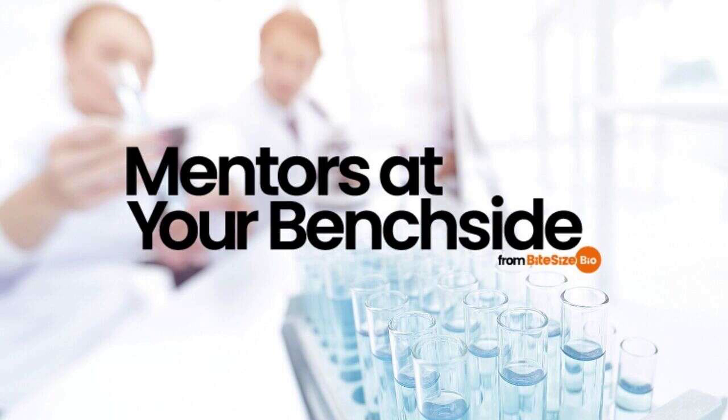The weighing equipment you use in a lab should always deliver accurate results, and all the elements that can cause any discrepancies should be eliminated where possible. Something as simple and innocuous seeming as the opening and closing of a freezer door can cause the temperature to fluctuate. This small temperature change in the environment should be prevented to ensure optimal conduction of weighing measurements.